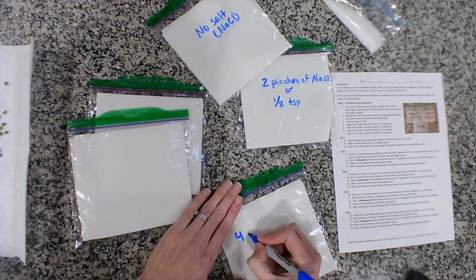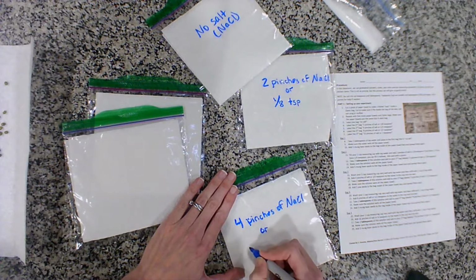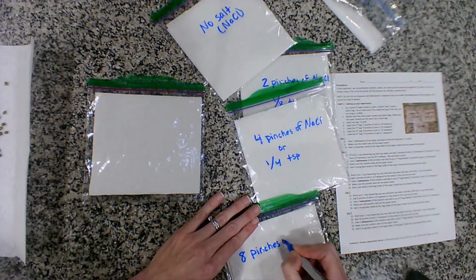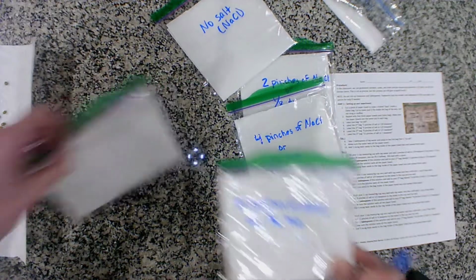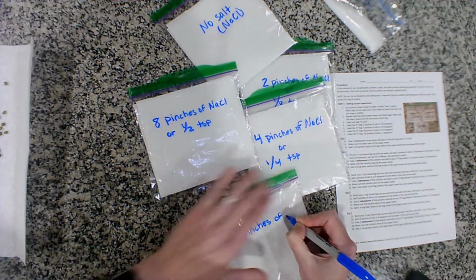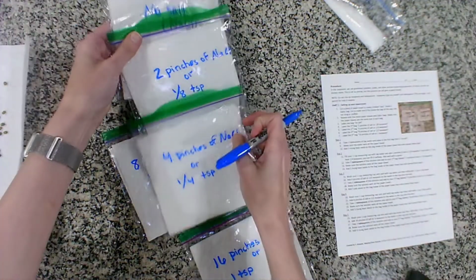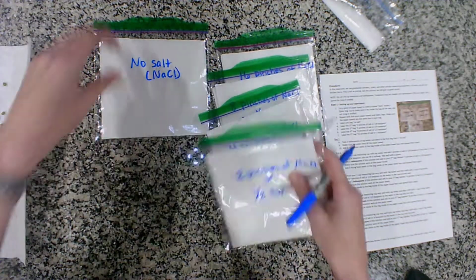Bag 3 is 4 pinches of NaCl, or 1/4 teaspoon. Bag 4, 8 pinches of NaCl, or 1/2 tsp. And then the final bag is 16 pinches of salt, or 1 teaspoon. Okay, so now I have all of my bags set up, and I'm going to stick them in the order that I'm going to use them. 16, 8, 4, 2, and none.